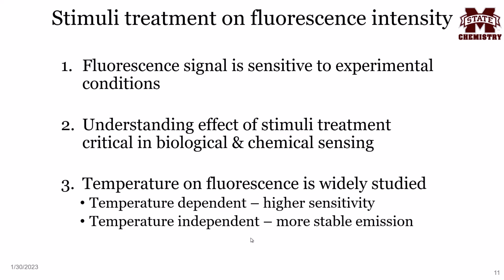Temperature's effect on fluorescence is widely studied. In some cases, we would want a temperature-dependent fluorophore to have a higher sensitivity to detect a change in the fluorescence intensity. Under other conditions and in different experimental environments, we also may want a temperature-independent fluorophore to have more stable emission and ensure that no matter the condition, we can have the same amount of emission occurring at all times.